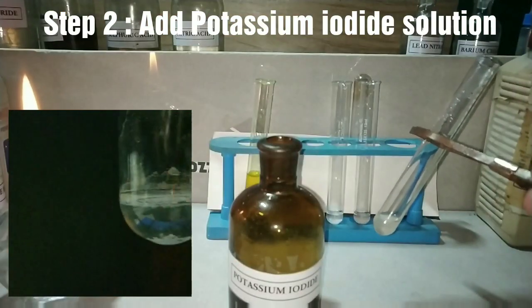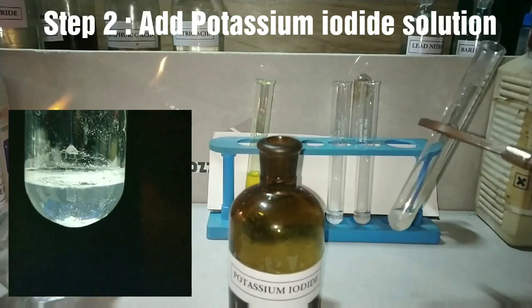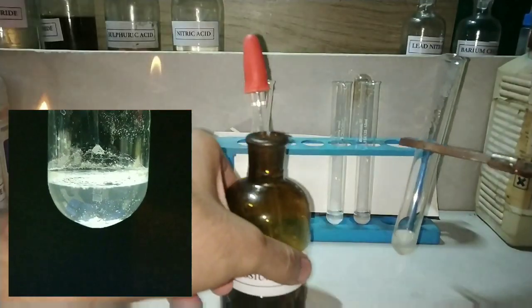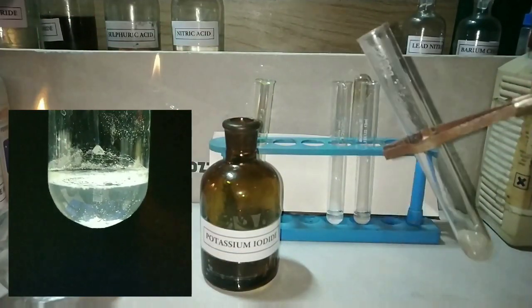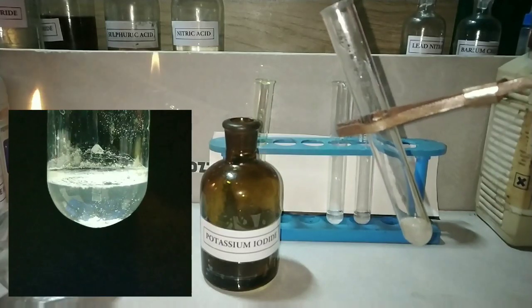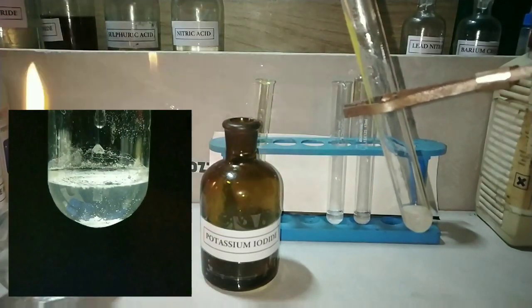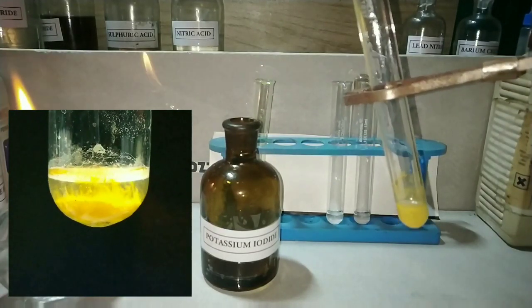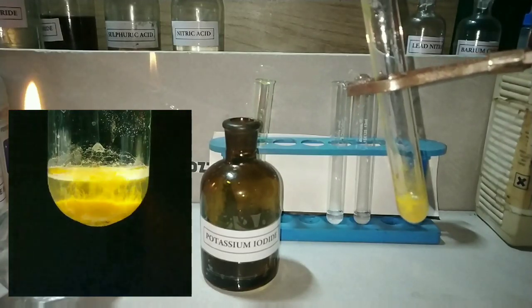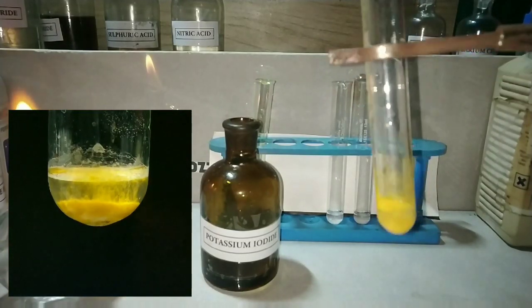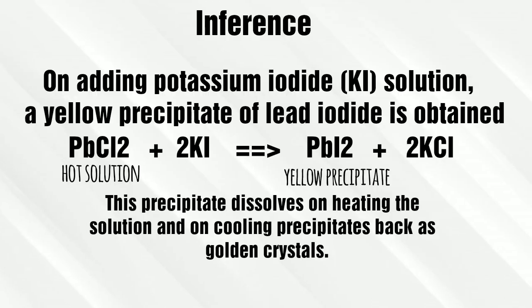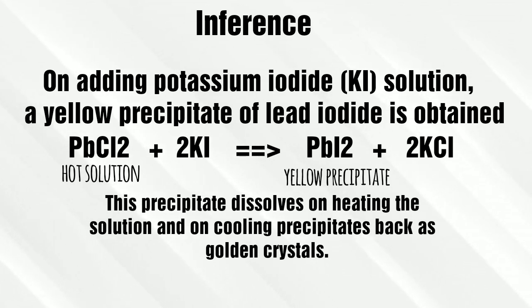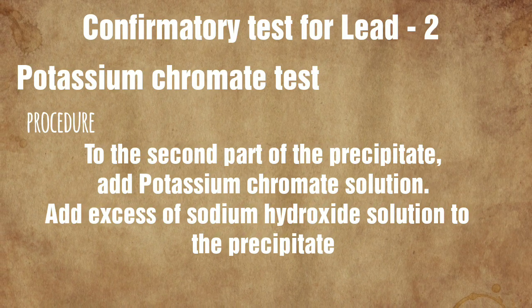The next step is to add the potassium iodide solution. This is a peculiar reaction — on adding potassium iodide, we obtain a yellow precipitate which is soluble in hot solution, and on cooling it precipitates out as golden yellow crystals. This is the classical experiment called the 'golden drain.' You can see the bright yellow color on adding the potassium iodide solution. A displacement reaction took place, leading to formation of the yellow precipitate of lead iodide.